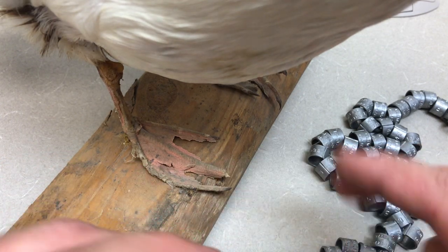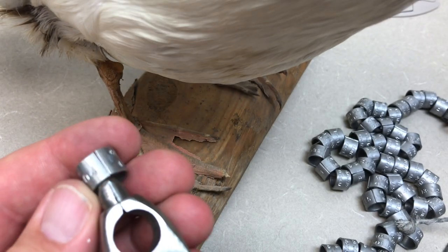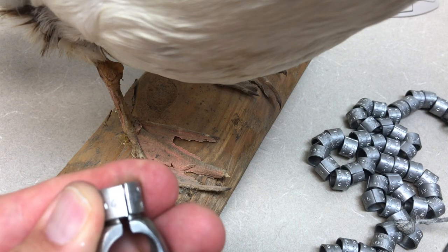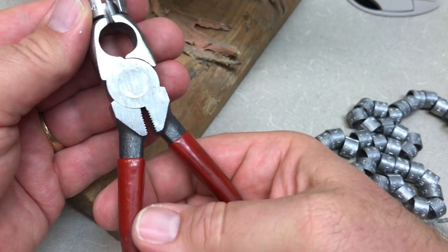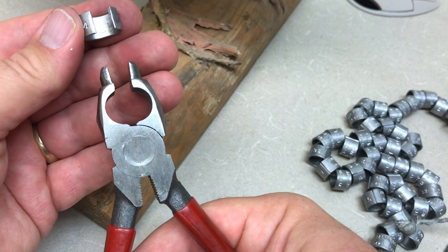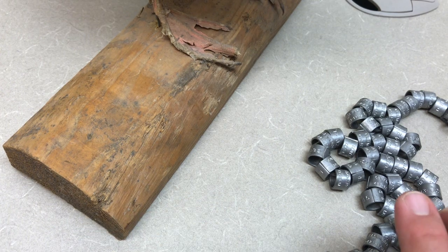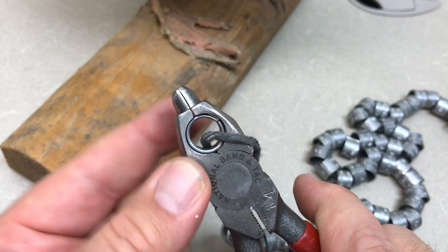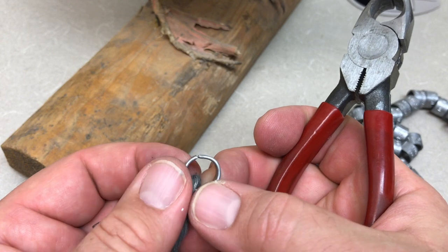We use them in the order they come off the string — we've got 005 next. We need to get that on there, so this is a pair of banding pliers. There's a variety of different styles; this one is made to stick this split design into the band. We reverse the pliers and push on one side to open up the band. These pliers are fitted to be the same size as the leg bands we're putting on, so when closed they fit nicely and help us close the leg band squarely.